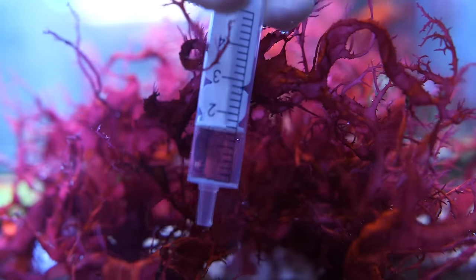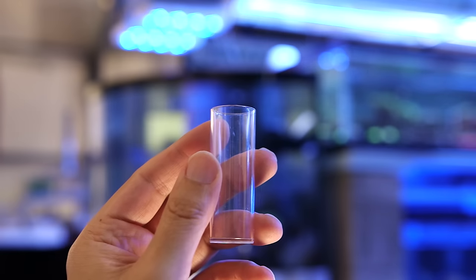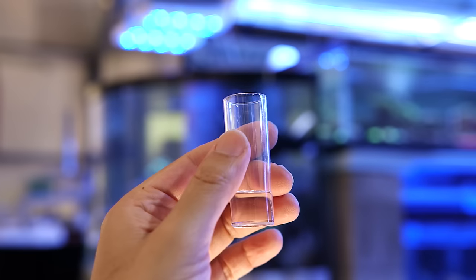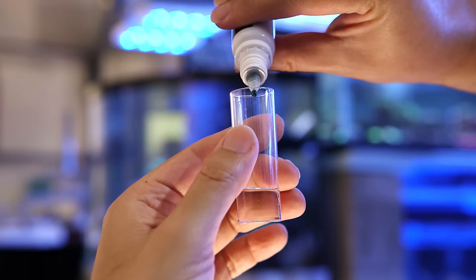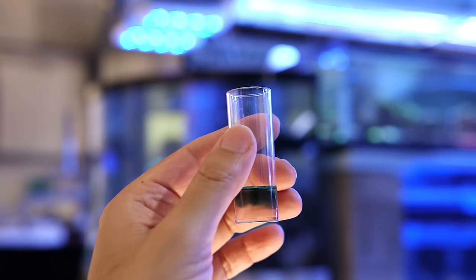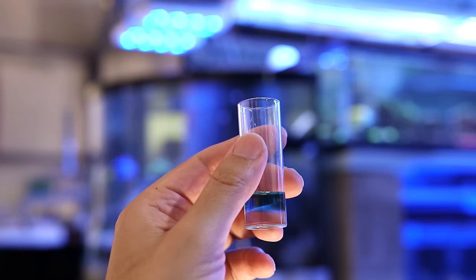Let's start by getting 4mL of tank water for our sample. Next, let's add the first reagent which is this inky chemical. The test calls for 4 drops. Be careful not to get any on your clothing because it can permanently stain.